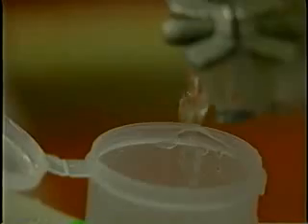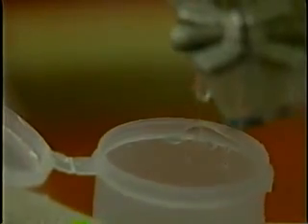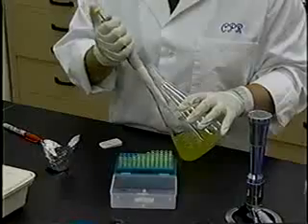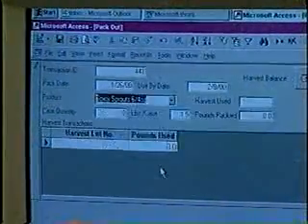In this module, we have learned why it is important to test irrigation water for pathogenic bacteria, how to take samples of spent irrigation water and/or sprouts for microbiological analysis, who should perform the test, how to interpret the results, and what action to take if a positive is found.